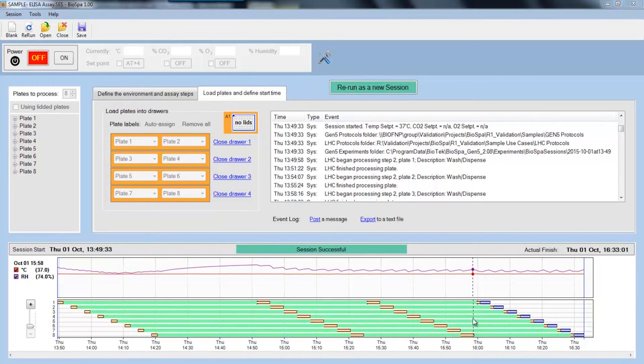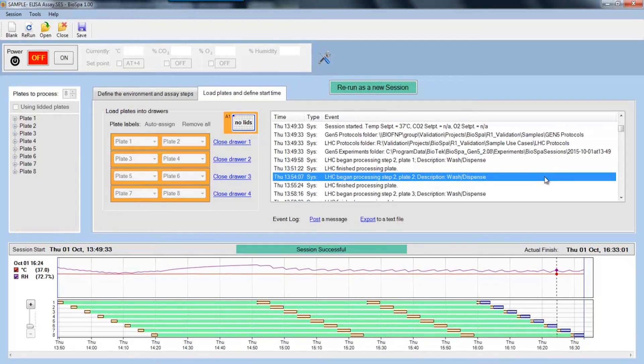To run the system, simply load your plates and hit start. The software generates a schedule that shows you all of the assay steps for each plate as well as the expected duration of the entire run. During the run, all assay parameters are recorded continuously. You can see here a run log as well as a parameter chart. If any parameter goes out of range during the run, you will get notified immediately by text or email.